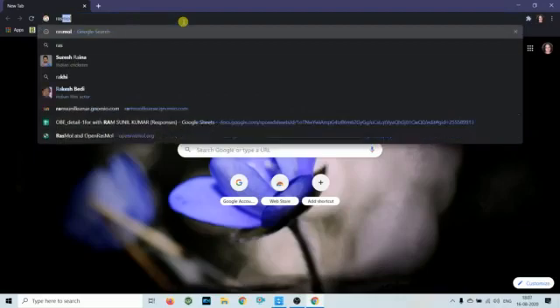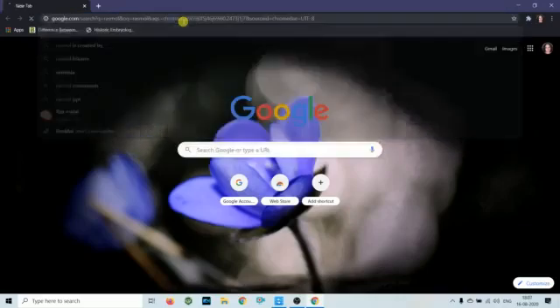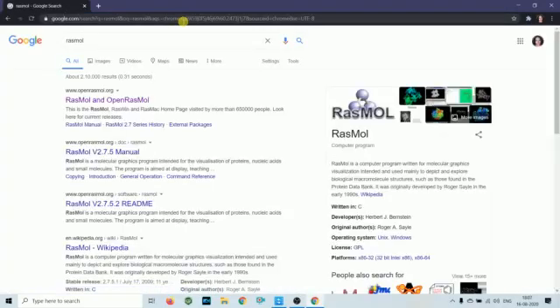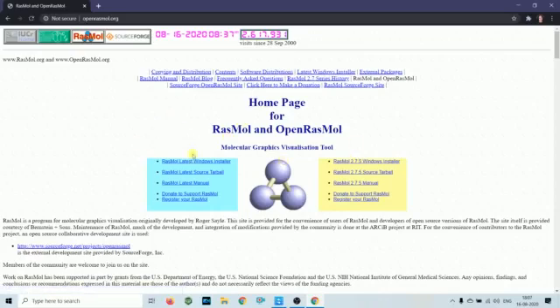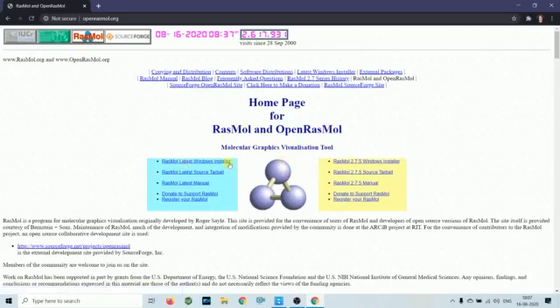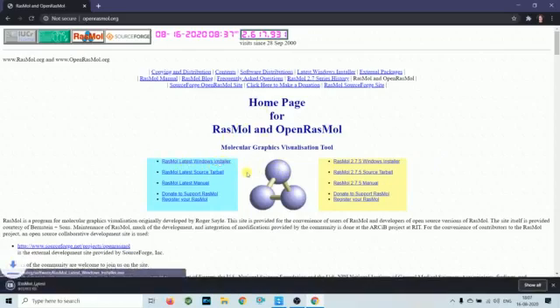You have to type RasMol in Google, and you have to download the installer according to your system. I will click on this.